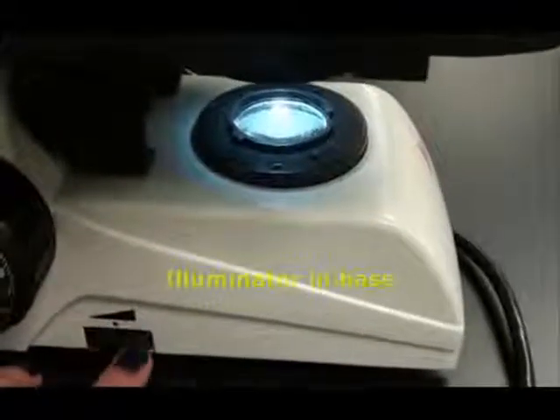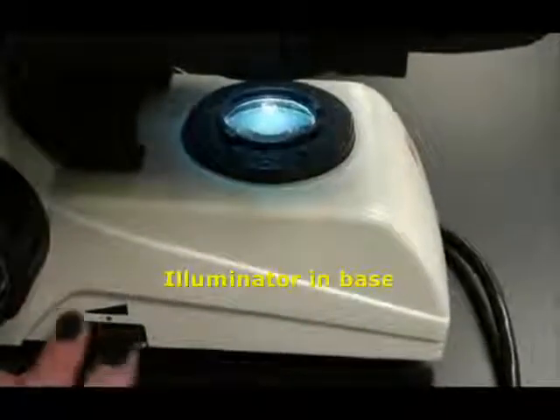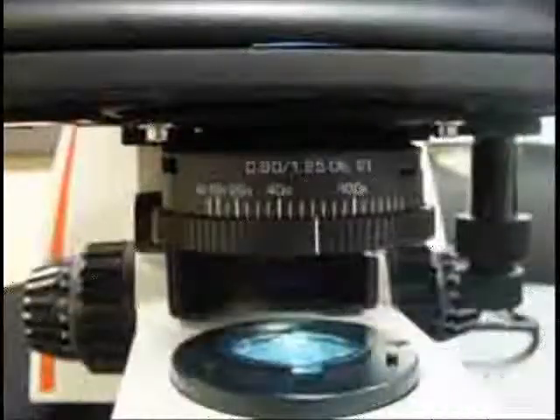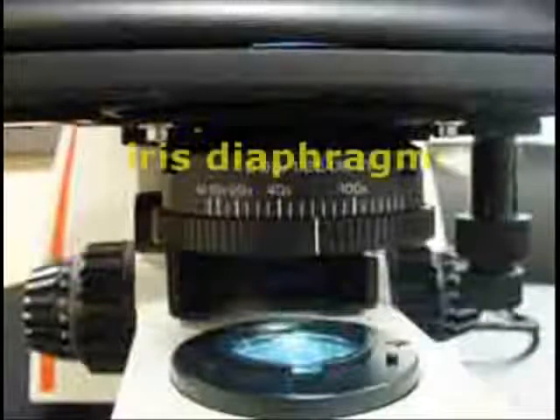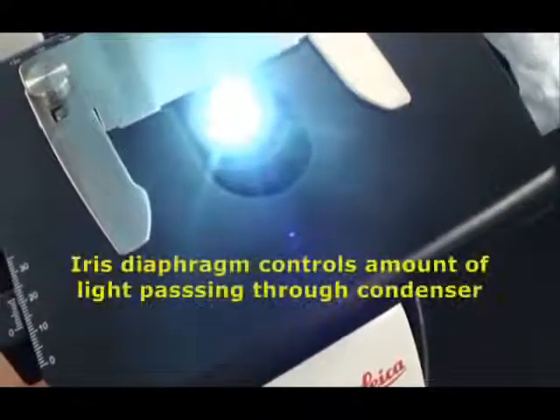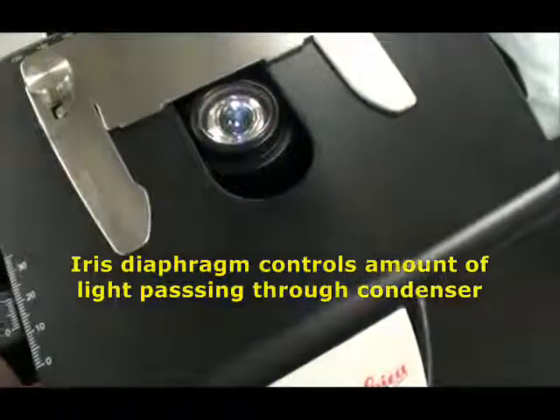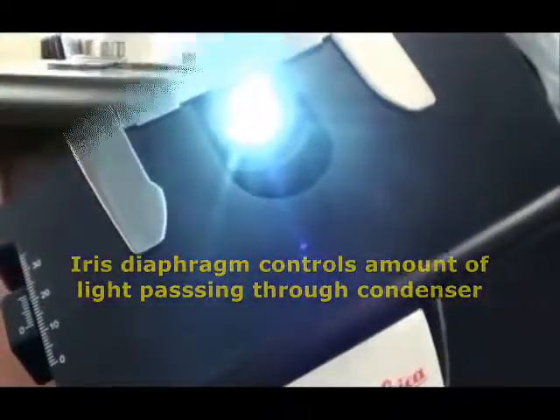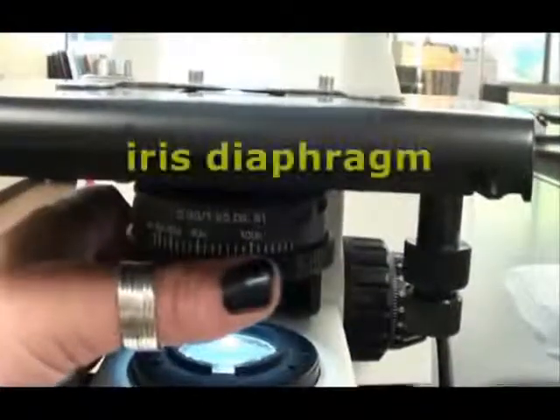Most compound light microscopes have a dial that will adjust the light level from the illuminator in the base. Another way that your scope allows you to adjust the amount of light shining up through the specimen is through manipulation of the iris diaphragm. This mechanism is located directly beneath the stage, and you twist it to open and close the iris.